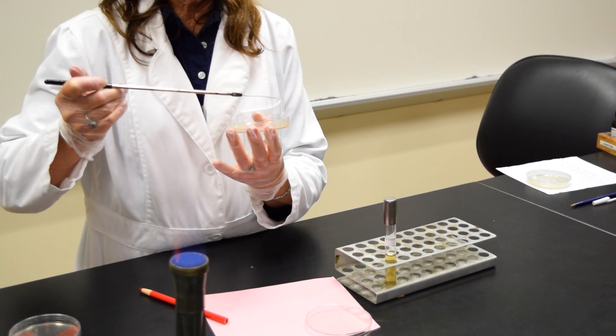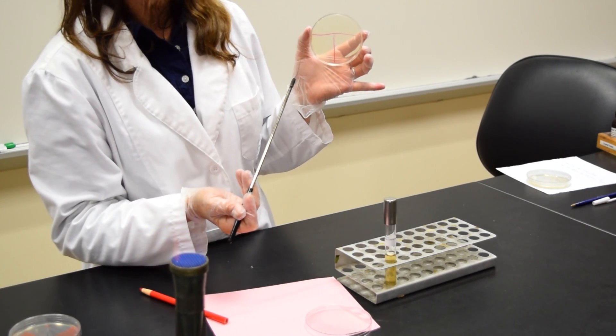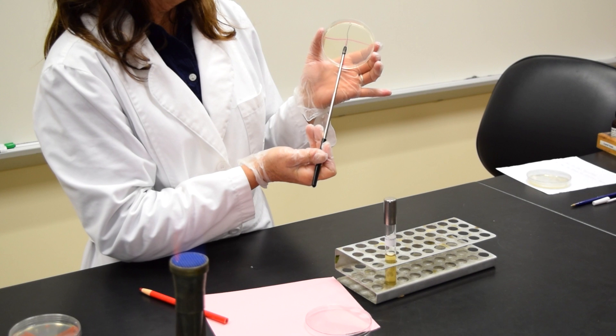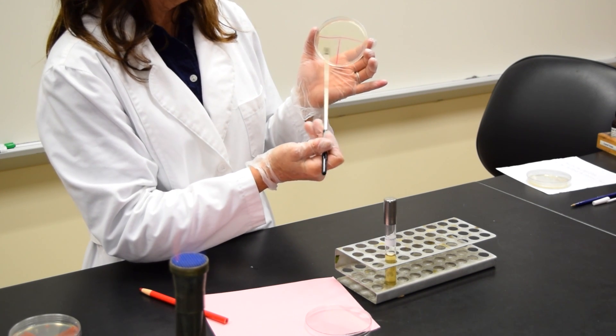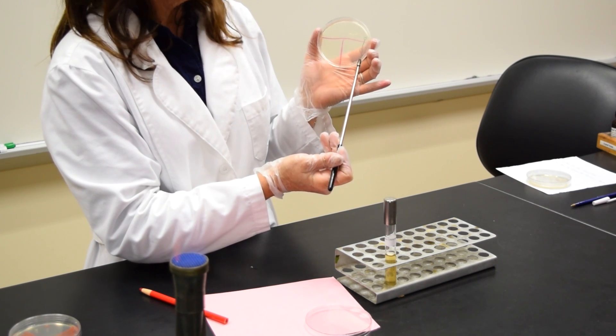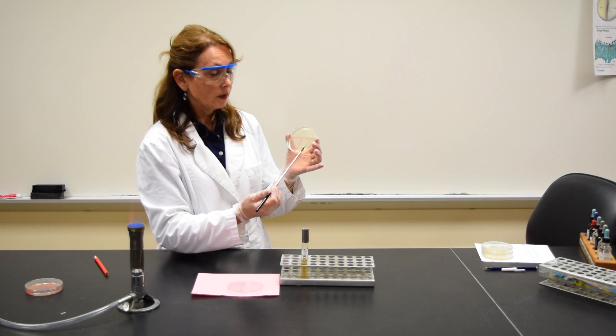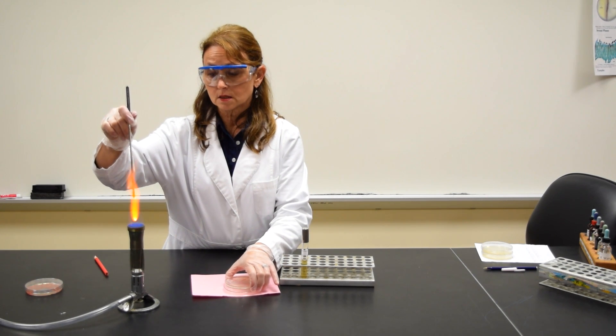You will be doing the procedure holding the plate horizontally, but just to show you, I'll be holding it vertically so you can see what I'm doing. I'm taking the inoculating loop and I'm going to streak it back and forth in area one, trying not to gouge the agar. When I get to the line, I'm then going to take the inoculating loop and sterilize it.